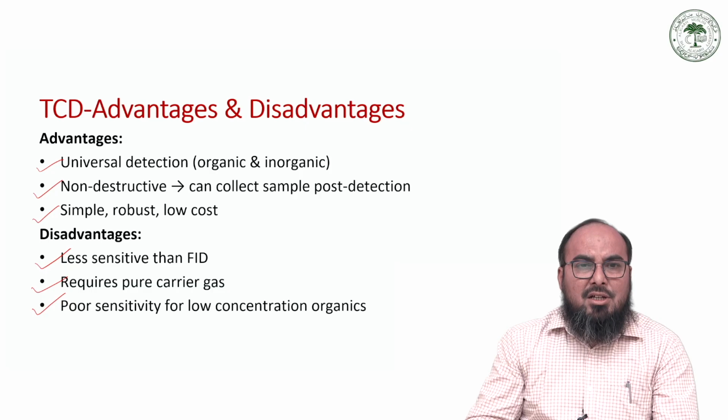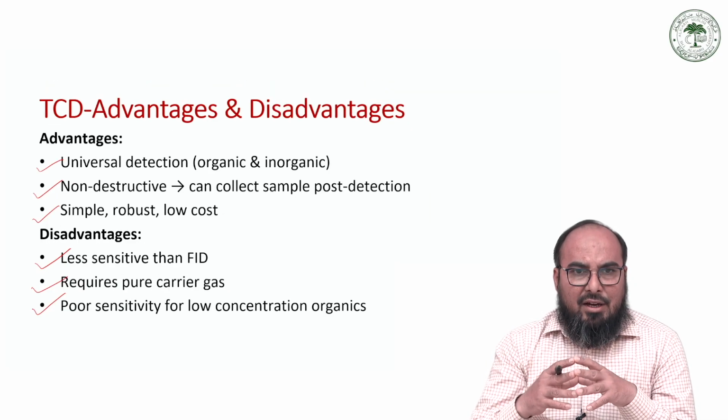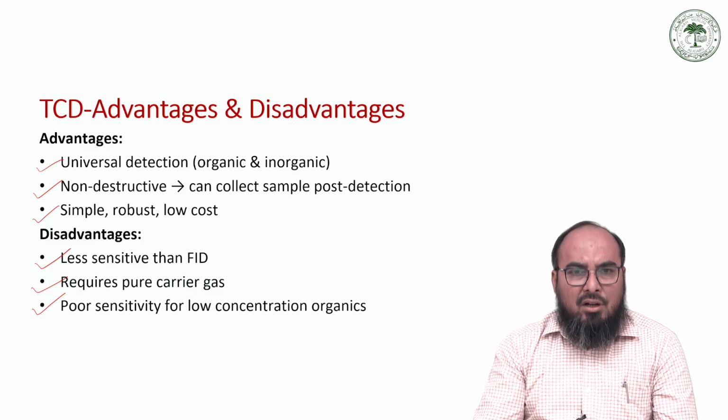So these are the advantages and disadvantages of TCD and FID. With this, we are going to explore the electron capture detector and other detectors in our next slides.